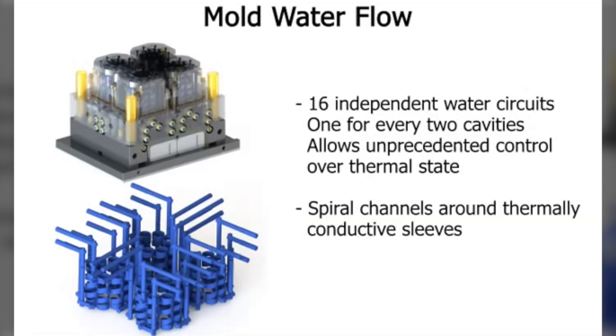The thermally conductive sleeve also has a very precise linear internal bore. The PMT cavity assembly is then inserted into this bore. This separation of the PMT cavities from the actual cooling water allows the cavities to be removed easily. There are 16 separate water line circuits on the four cavity clusters alone, one for each set of two cavities, allowing the user to adjust cooling water temperature to individual pairs of cavities for unprecedented control over tip straightness. These cooling circuits are also carefully designed to guarantee even flow balance throughout each cluster.